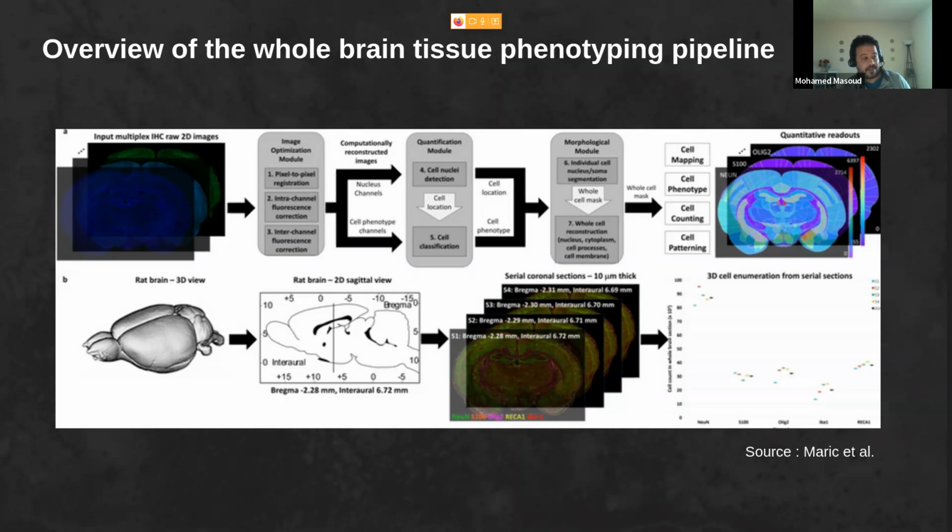And there is something different from the MRI we know: this is a very high resolution, maybe on average 10,000 pixels wide by 10,000 pixels high, for example. So one slice can be up to 1 gigabyte, and I see a stack of 40 channels can be up to 30 gigabytes.